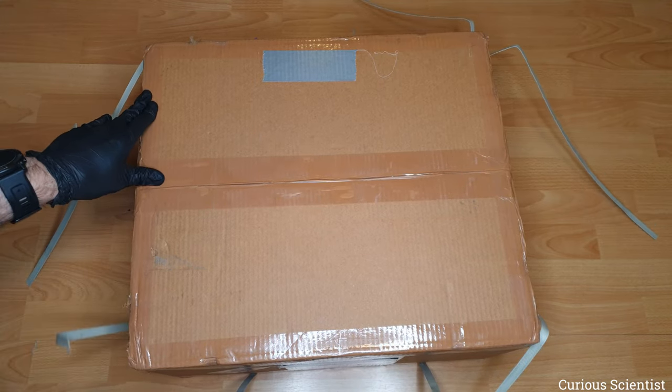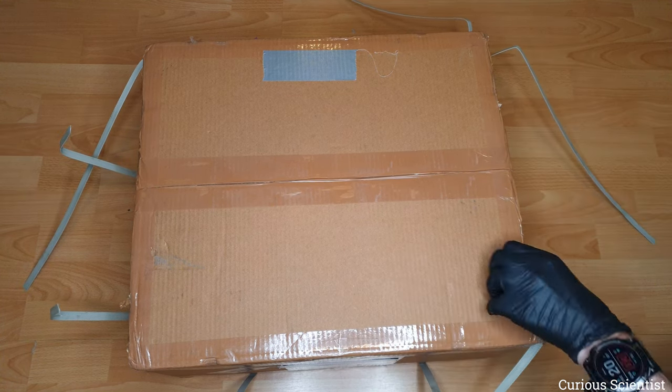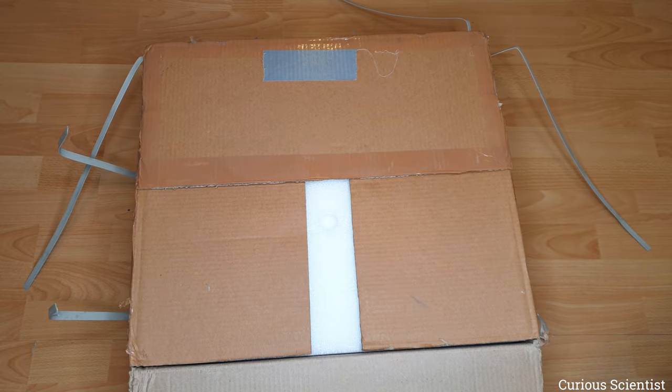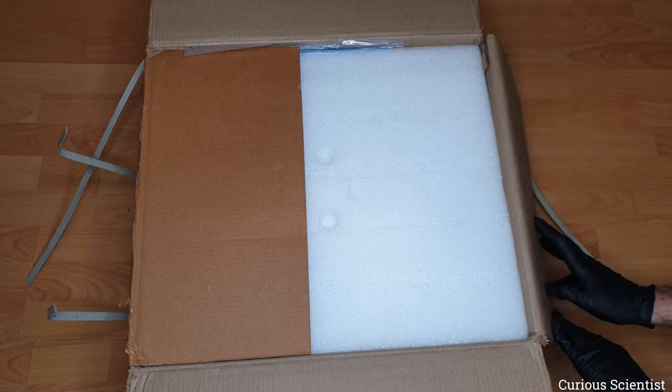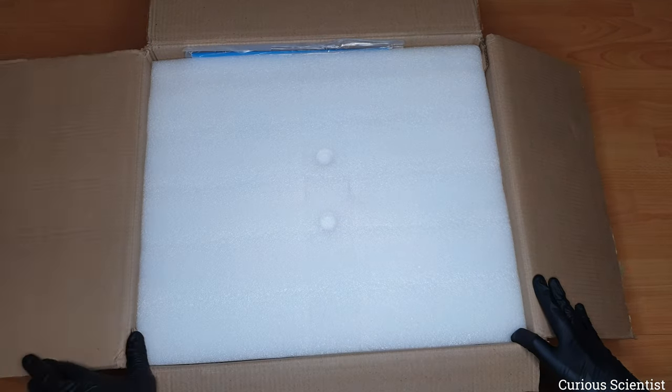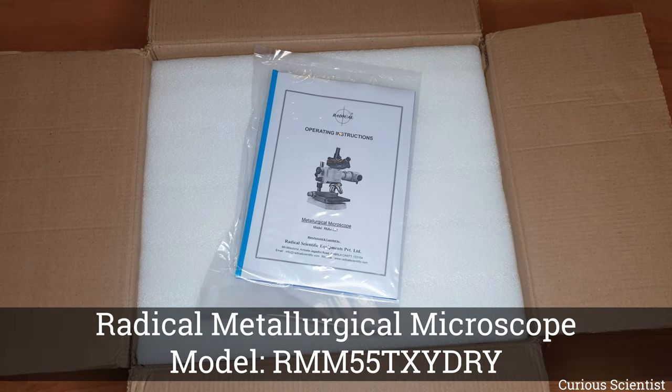This microscope was for sale at a reasonable price. I found it on eBay so I purchased it, and now in this video I am going to assemble it, show you all its parts and all its properties. So let's see what is inside the box.